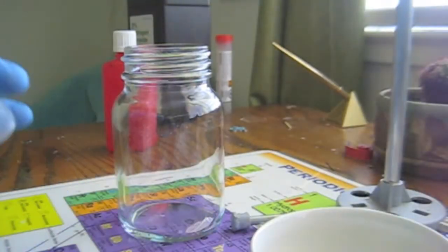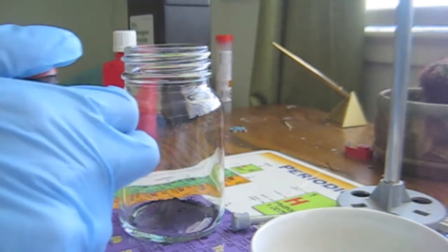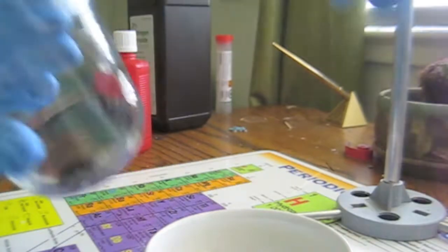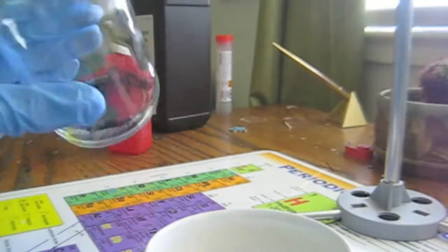Let's get started. First we'll take three scoops of potassium permanganate and put them in a small jar. Then we'll take two scoops of sugar and add them to the jar. We'll mix everything together really good, crushing any big chunks.